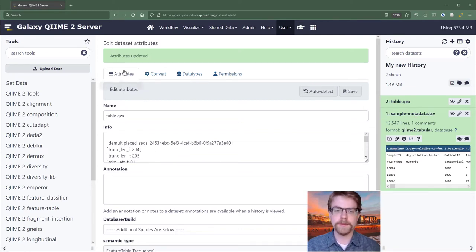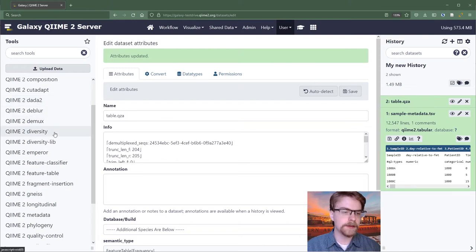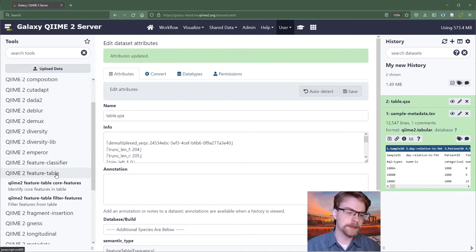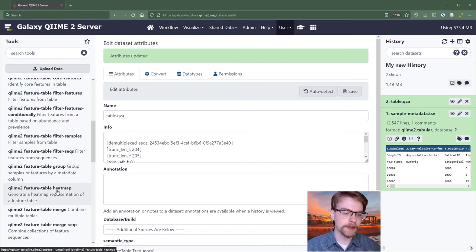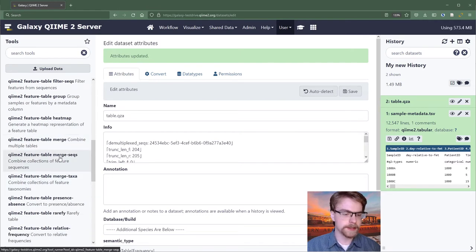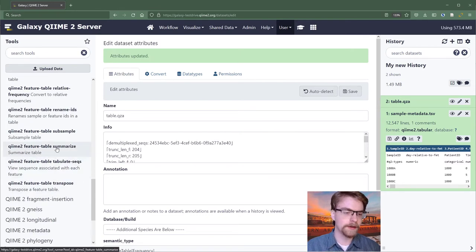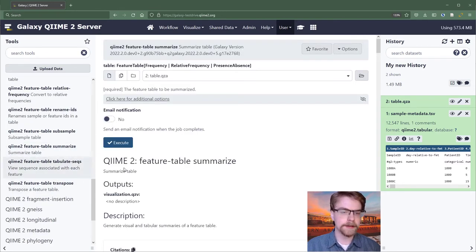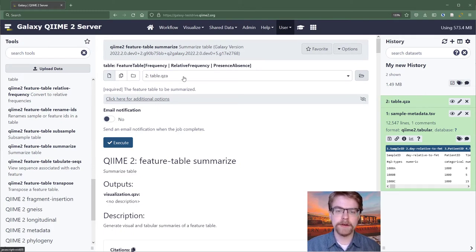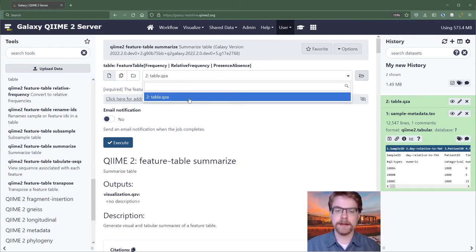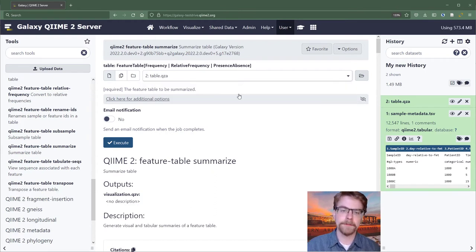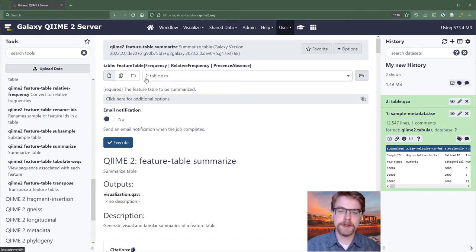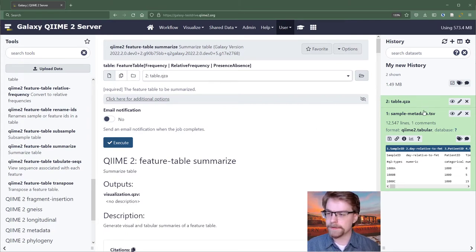Let's suppose we wanted to actually run an action. I might use feature table summarize as an example. And you'll do this in detail in a tutorial. But to get started, we look at this. We see Galaxy has already auto-populated the input. This is something that's both convenient and you want to watch out for. Because it is going to pick the most recent data that fits.